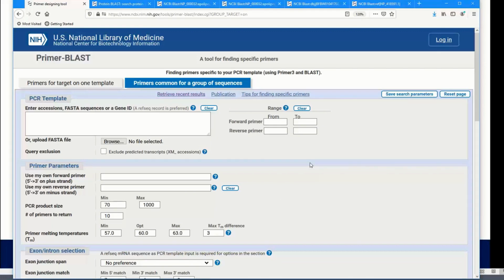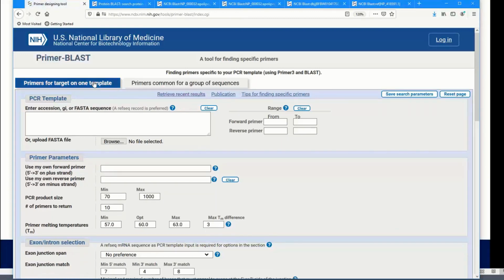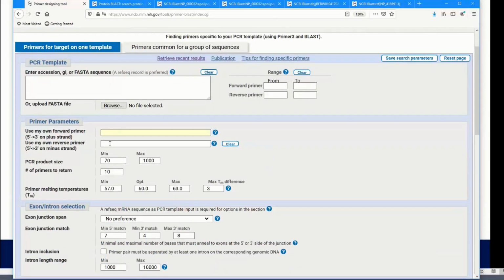Great, now we have more application questions. One of them is specifically about using primers. What if they happen to have a set of primers and they want to be able to figure out where it would amplify? Is there a way to identify what region would be amplified with a set of two primers? Yes, and in fact, we did that today. We found what region would be amplified from a piece of genomic DNA, but you can just put your primers in these two boxes here, forward and reverse.